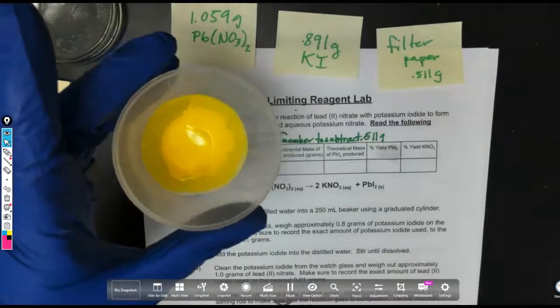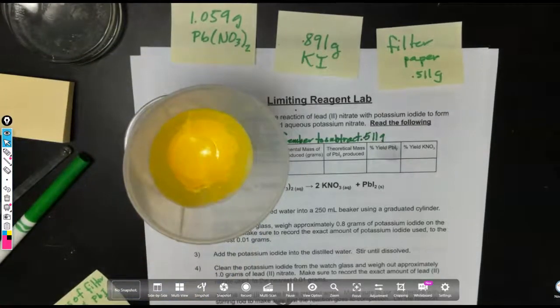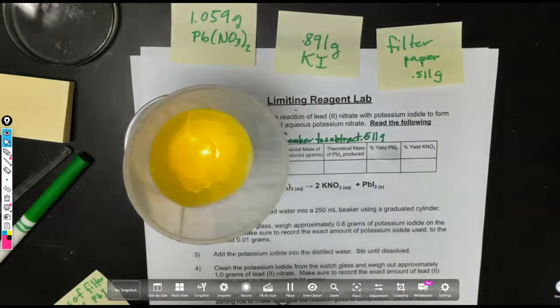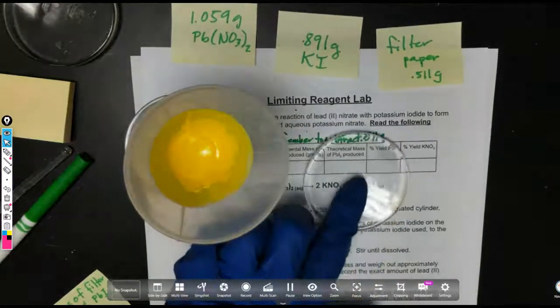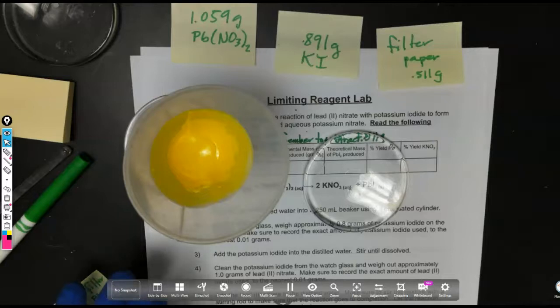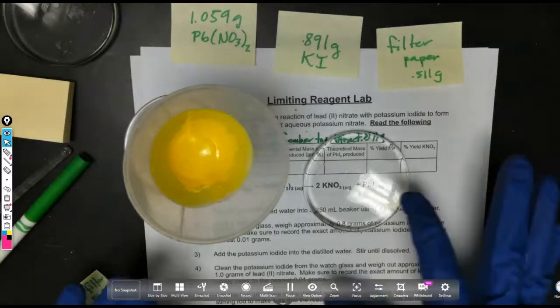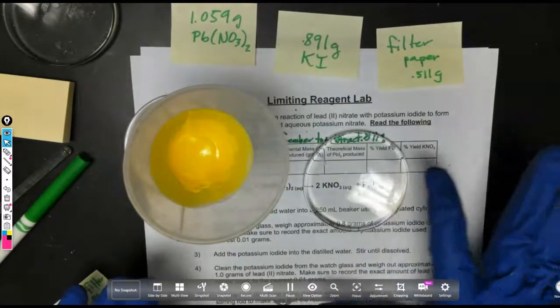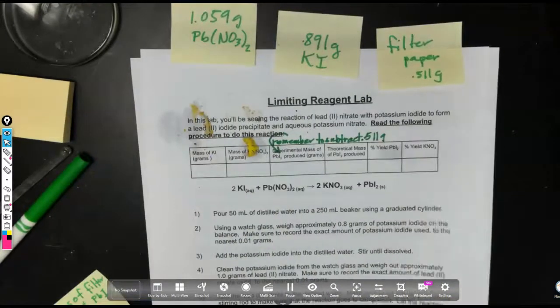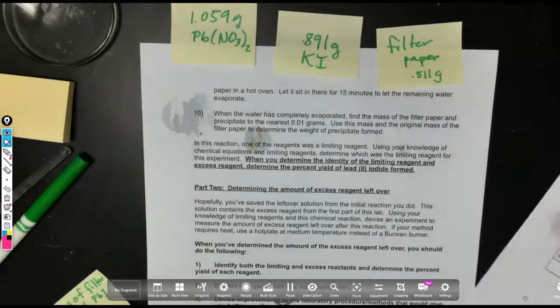It is still wet though, so I am going to finish up this by drying the filter paper with paper towel as much as possible, but then placing the filter paper onto a watch glass and putting the watch glass into my oven to let it dry so that we remove all of the remaining wetness on the filter paper. So when we get done, we will have a final mass of the filter paper and the solid precipitate that we get afterwards.